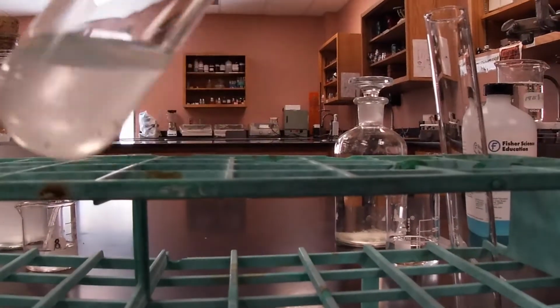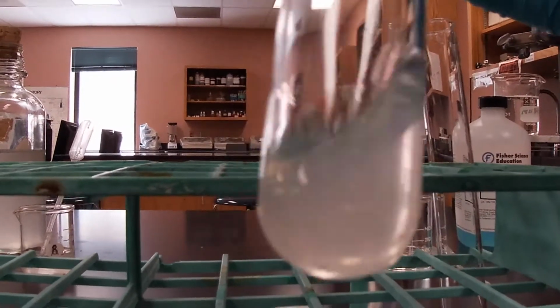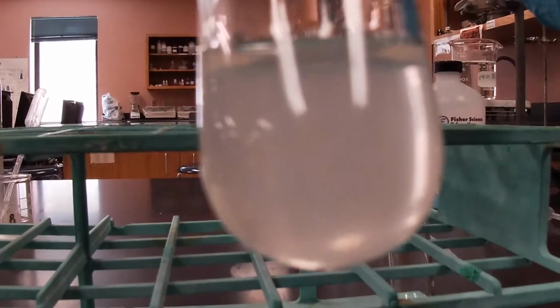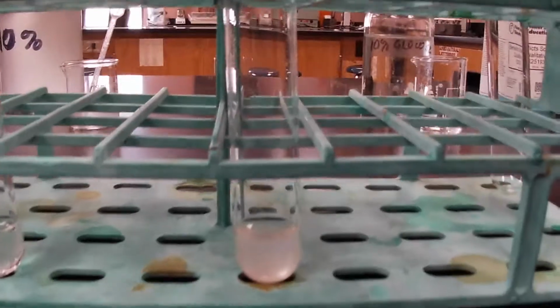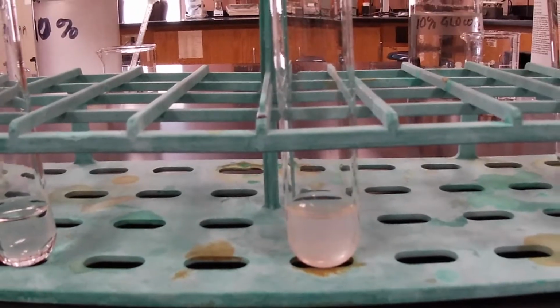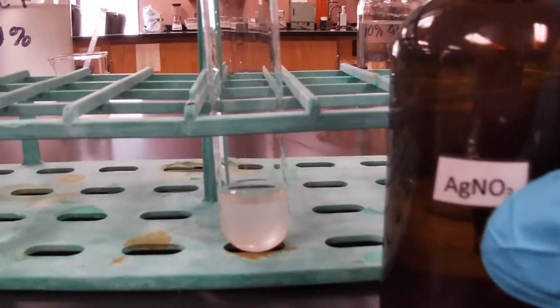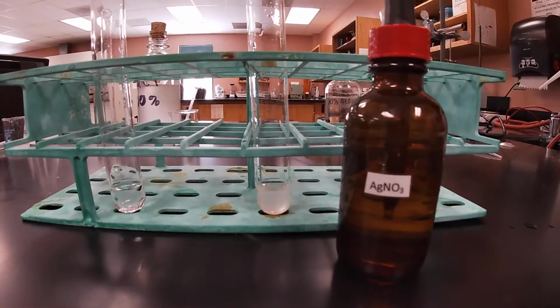So this is when two clear solutions or two soluble solutions come into contact. And if you notice, you can hopefully see the little flakes of that precipitate. So that's what we expect when we look for that chloride ion. We're going to see if there is some chloride ion present in the addition of the silver nitrate. Once we add the silver nitrate, we should expect a precipitate to occur.